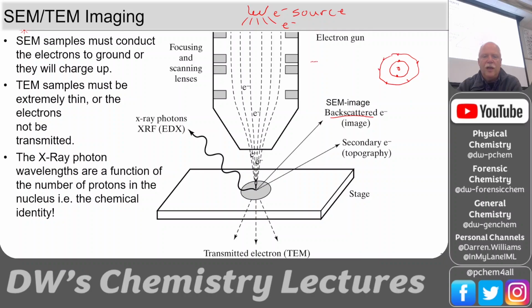And we've got an electron here that's coming in at incredibly high energy, and it scatters off that electron, ejects it. So we can knock out core electrons with electrons, and then we can get the X-ray light out. So that's what these X-ray photons coming out are. They have a signal very similar to X-ray fluorescence, but we didn't hit it with X-rays. We hit it with high energy electrons.